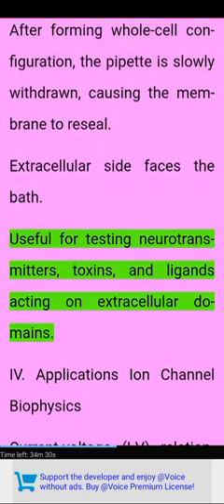Extracellular side faces the bath. Useful for testing neurotransmitters, toxins, and ligands acting on extracellular domains.